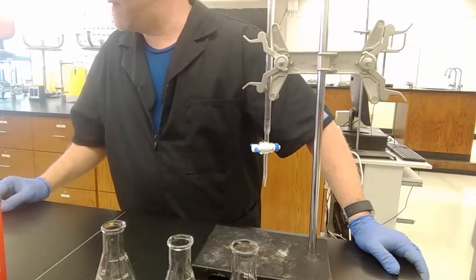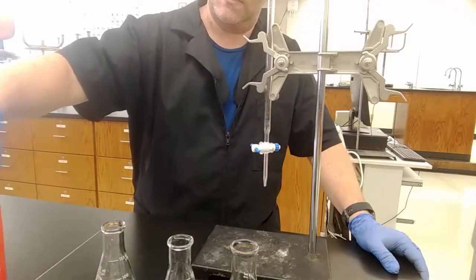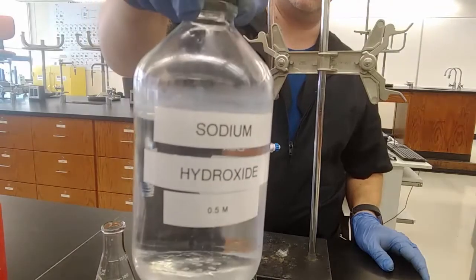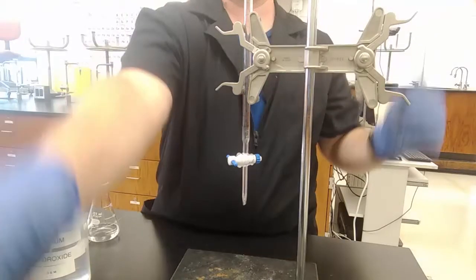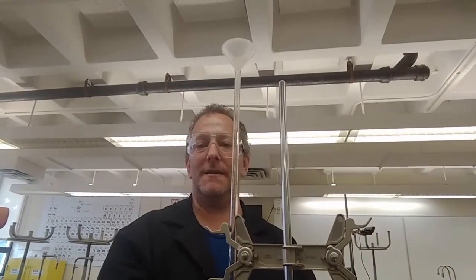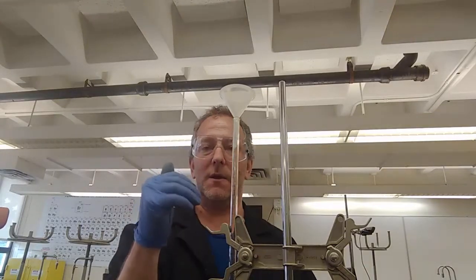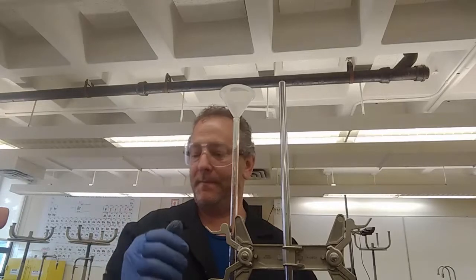Step 7, use a funnel to carefully fill the burette with an aqueous 0.5 molar NaOH solution. I have aqueous sodium hydroxide 0.5 molar solution. I have a funnel, and I'm going to put it in the top. You guys see that? Which is a little bit over my head, which is kind of dangerous. So I'm going to bring it down as low as I can. If I couldn't get it down any lower, because the burette was longer, I would get a step stool and climb up.